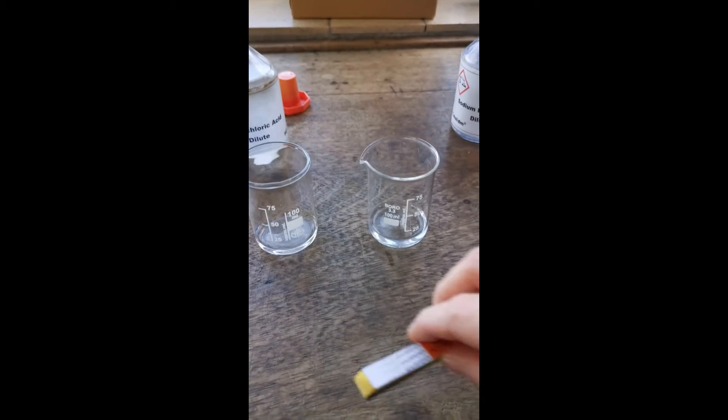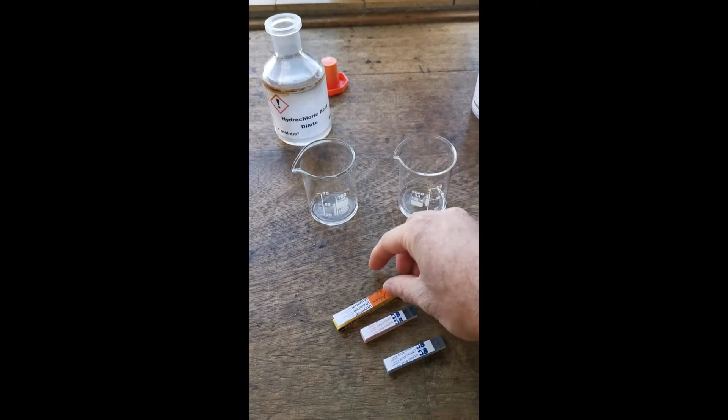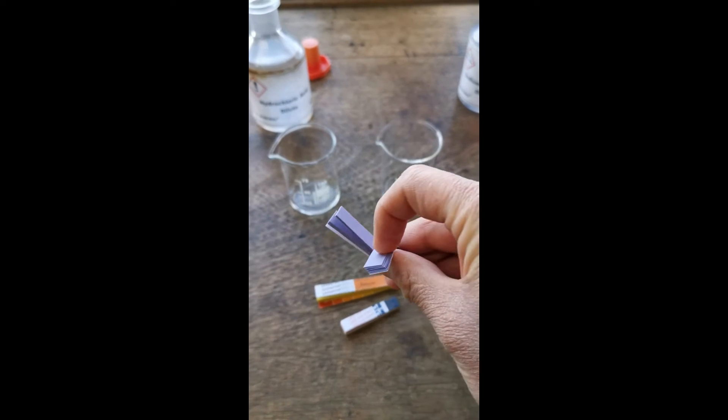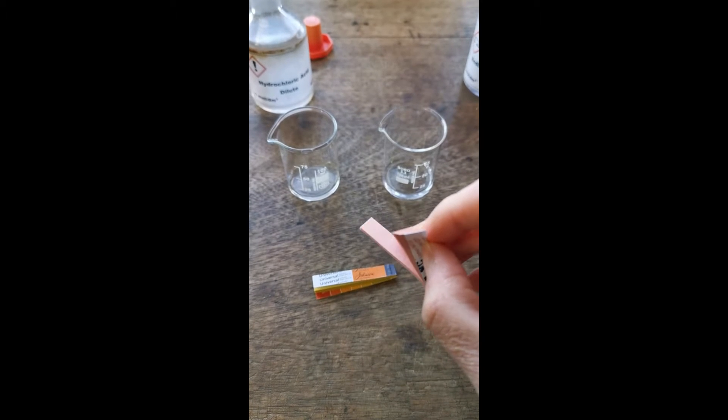Now we have some indicator papers here. We have universal indicator paper, which is yellow. We have blue litmus paper, which as you can see from the colour is blue. And we have red litmus paper, which as you can see from the colour is red.